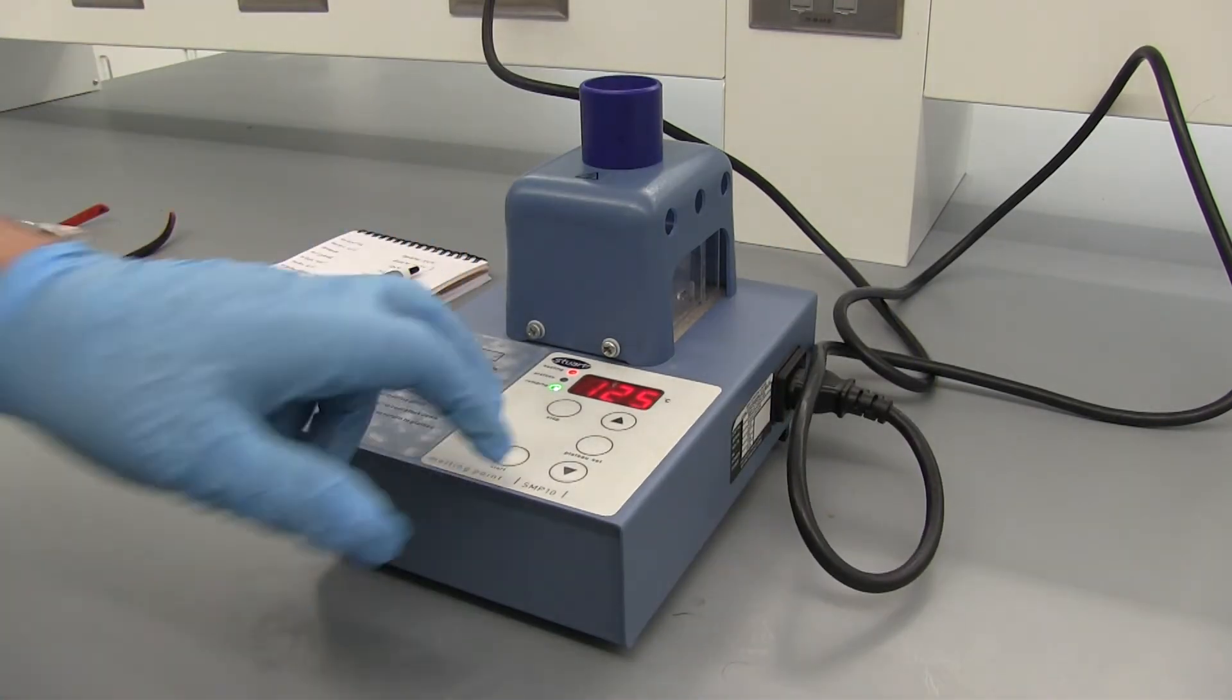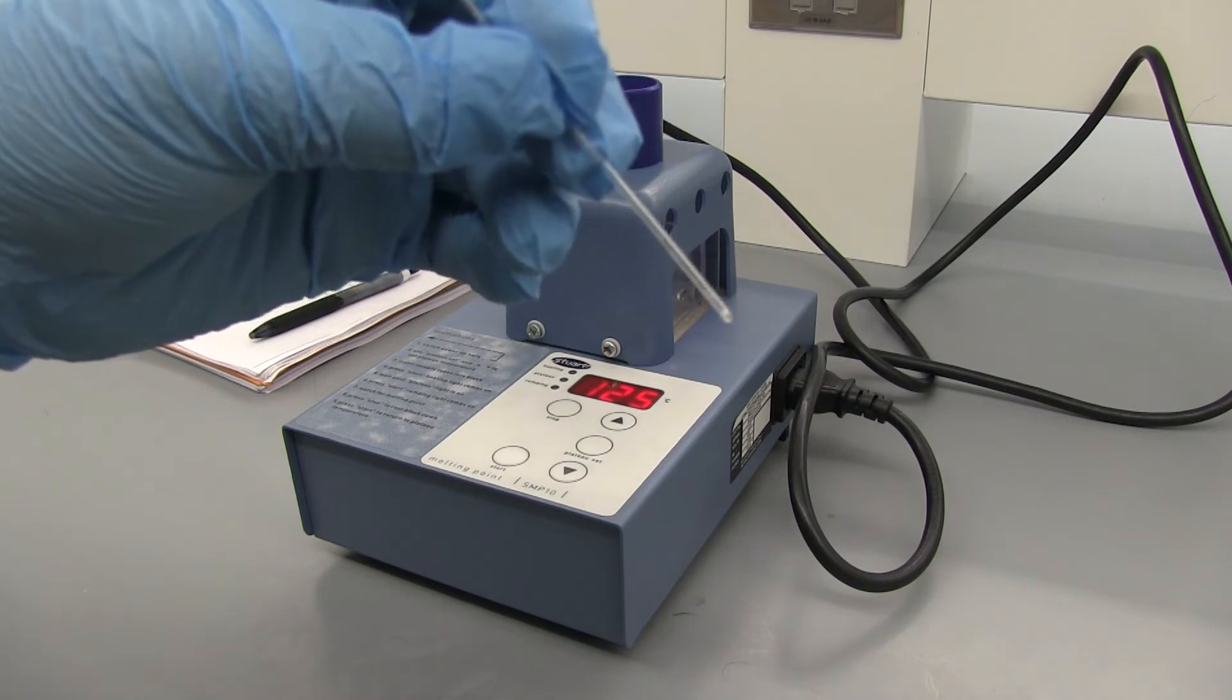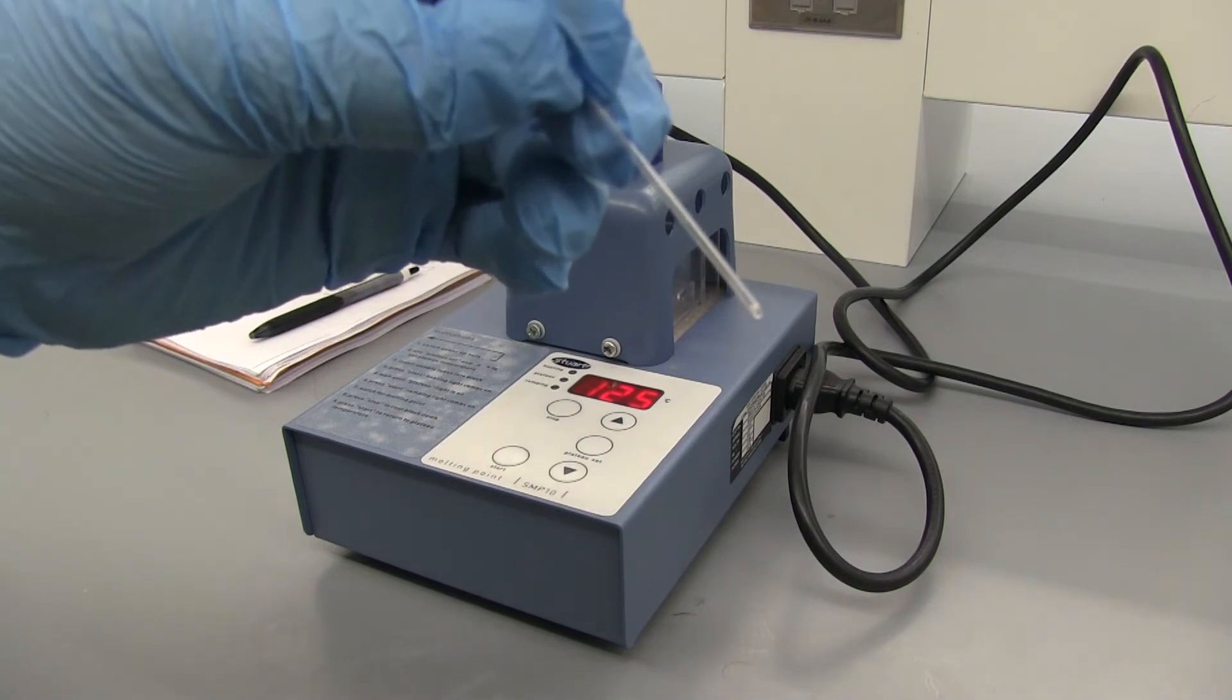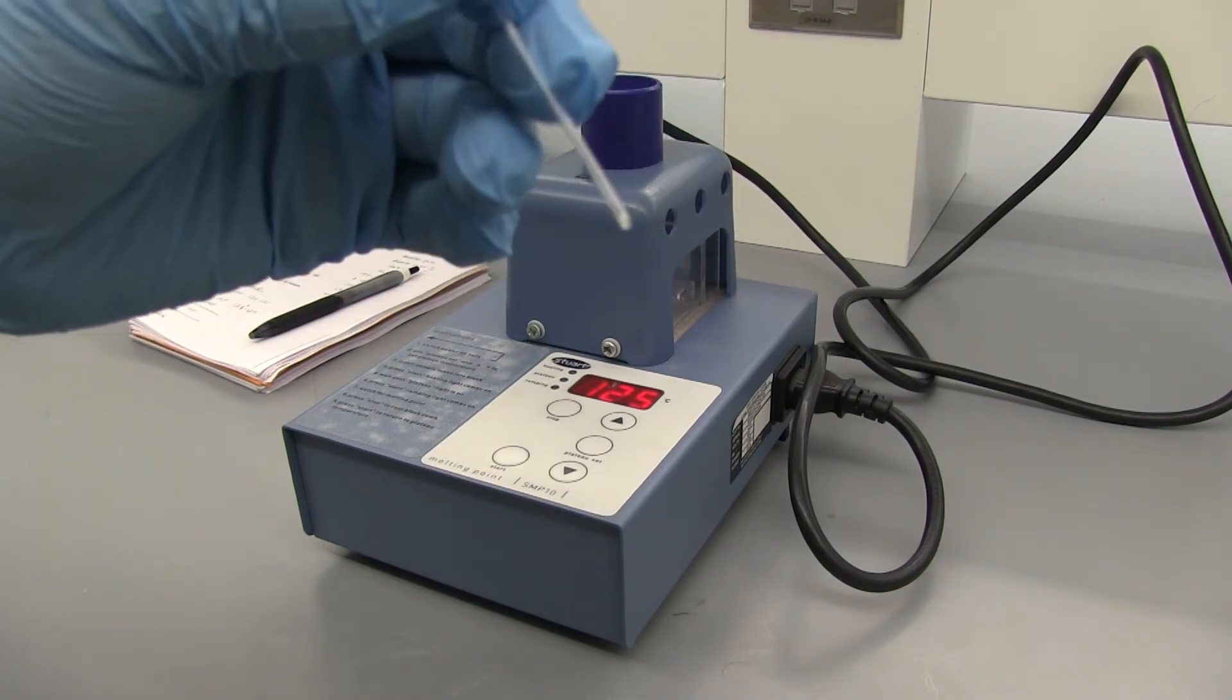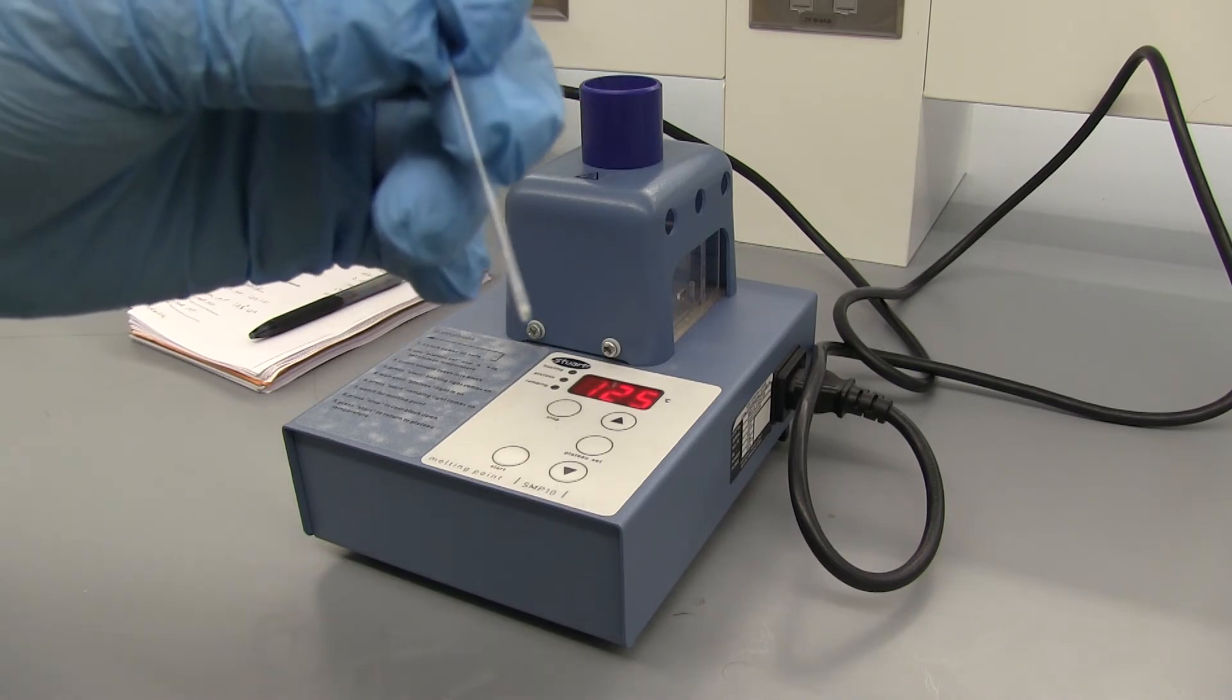Alright so now that we've stopped we can press stop button, let the heating block cool back down. Our slow melting point was 122 degrees Celsius to 124 degrees Celsius. So it seems likely that our identity is benzoic acid.